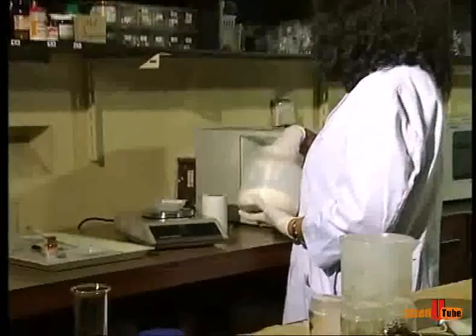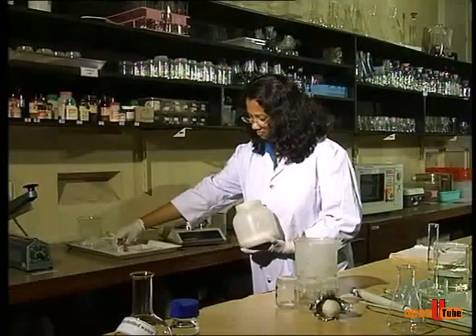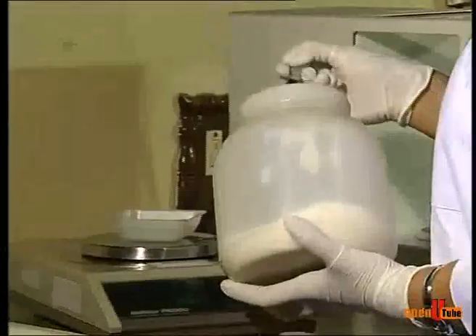Then weigh sugar and transfer to the same beaker containing distilled water, macro and micronutrients, and iron EDTA solution.